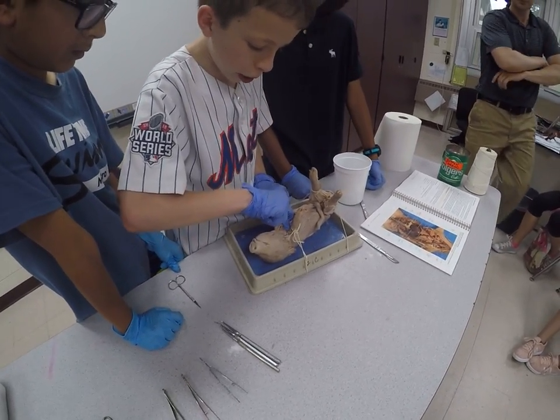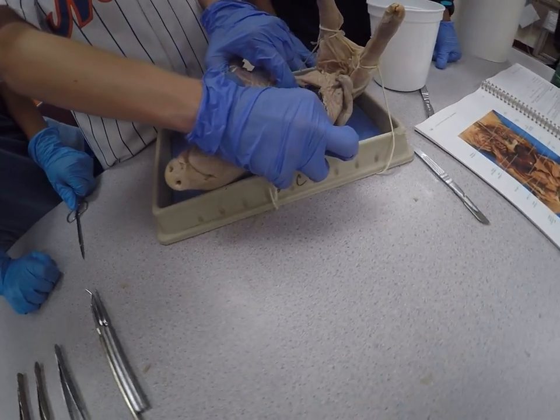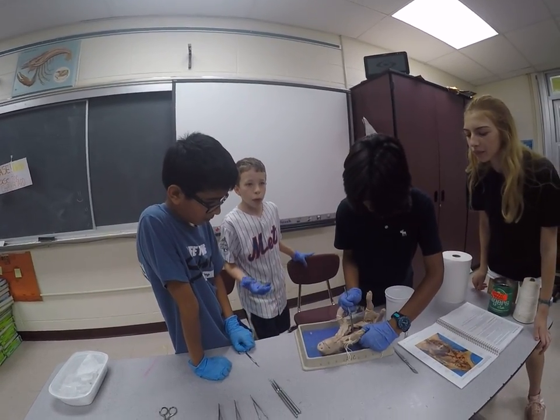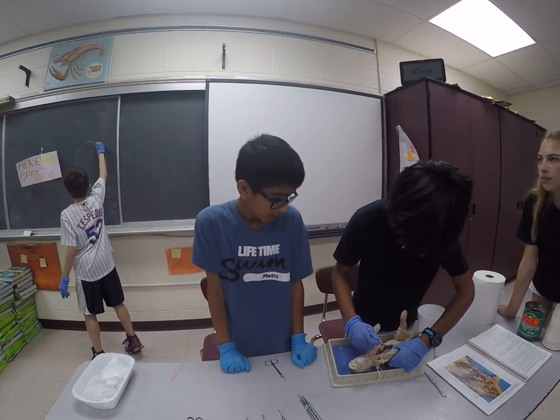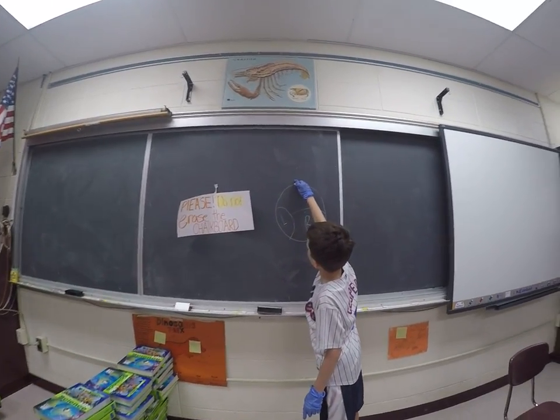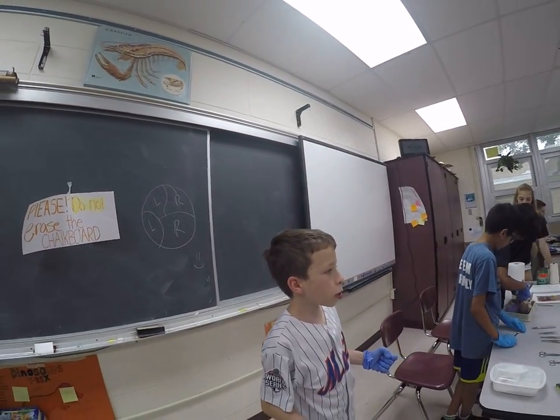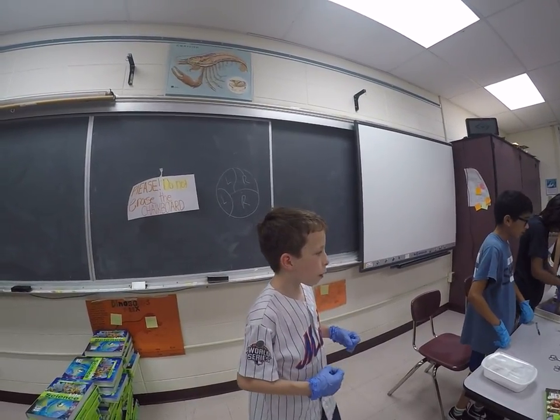I will try to pull the heart out. If you look right there, you will now see a pig heart. The pig heart is a four-section heart, including two ventricles and two atriums. There are two ventricles — left and right — and up top are two atriums, also left and right. Those two, along with the veins and arteries, pump out blood — either oxygenated, meaning with oxygen, or deoxygenated, meaning without oxygen — to and from the brain and other organs. Arteries are normally a bit bigger.